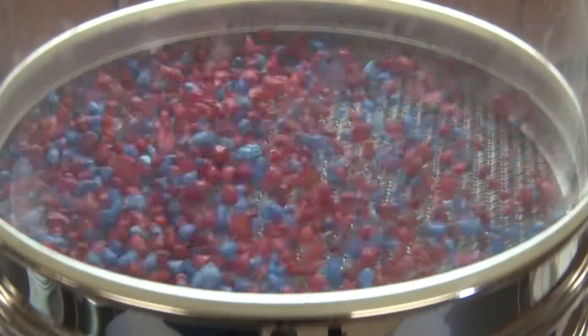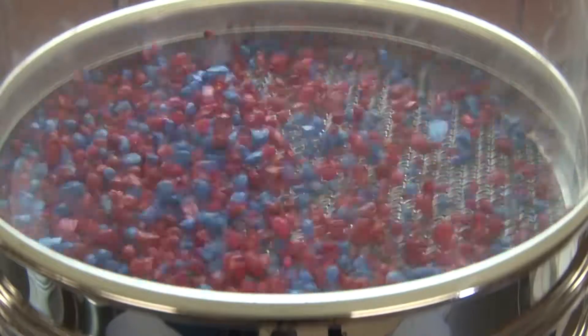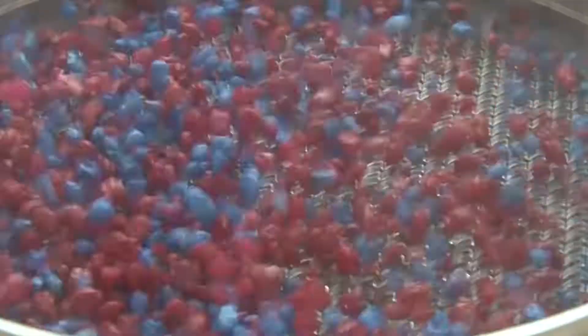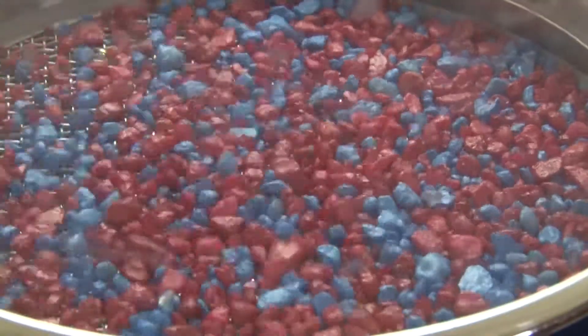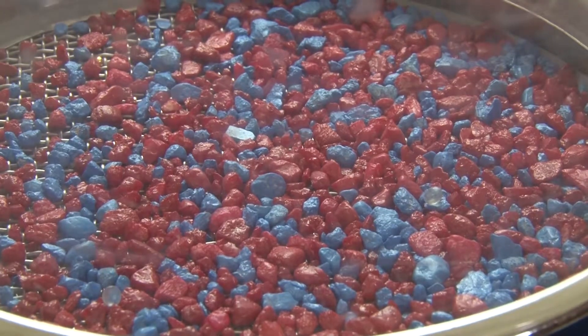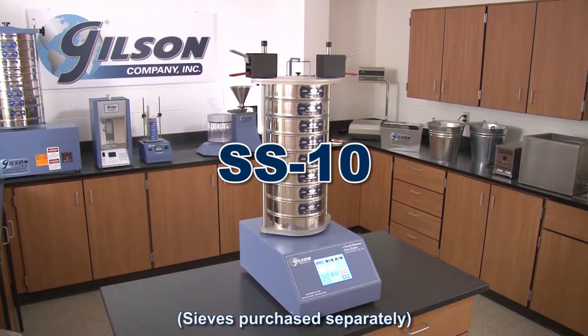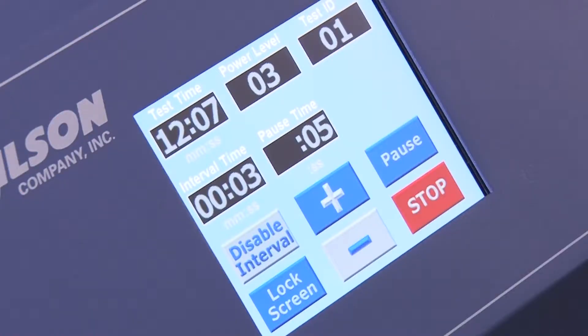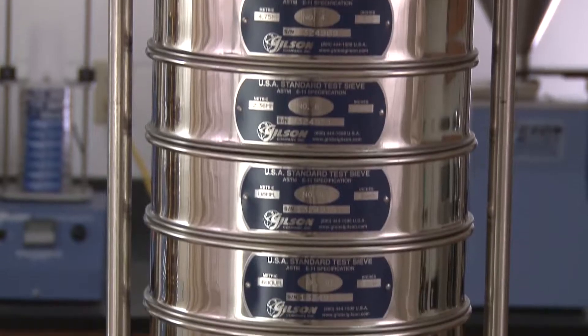Vibratory sieve shakers use electromagnetic energy to agitate particles and create a fluid bed as the test sample is evenly distributed across the sieve mesh. Units with a programmable POS feature encourage increased passage of fines. And Gilson's SS10 one-touch vibratory 8-inch sieve shaker combines the latest in electronic control with proven separation technology for fast, accurate separations of samples without the loud tapping noise.